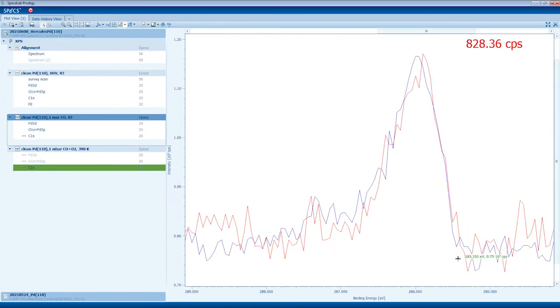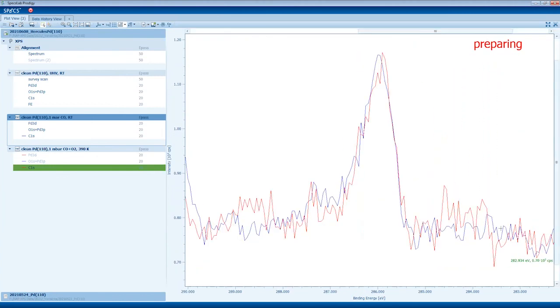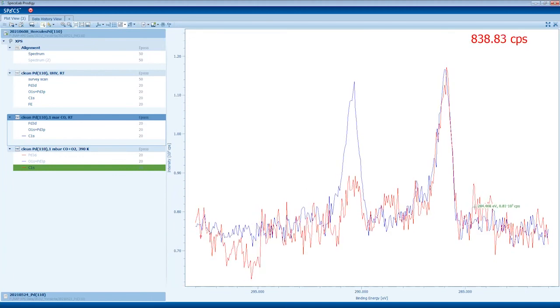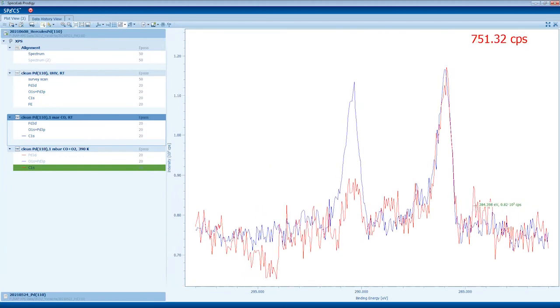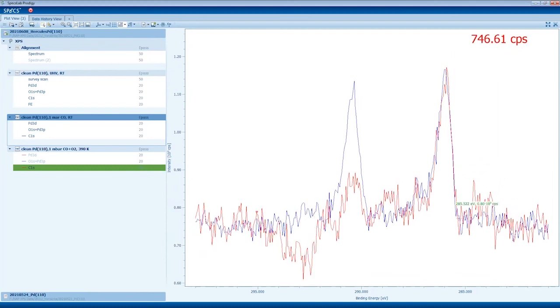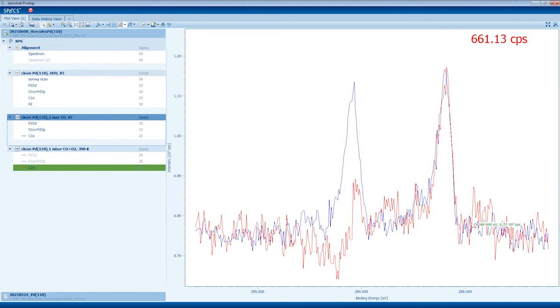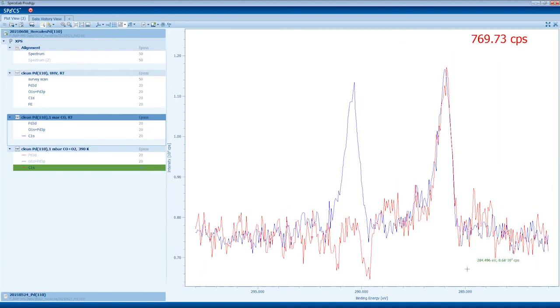Yeah, maybe it looks like something actually appears here. Hard to say what this is. Maybe it's a low binding energy, quite low, but it looks like normal carbon, maybe at 284.5. So maybe some kind of pure carbon is formed as soon as the reaction starts.